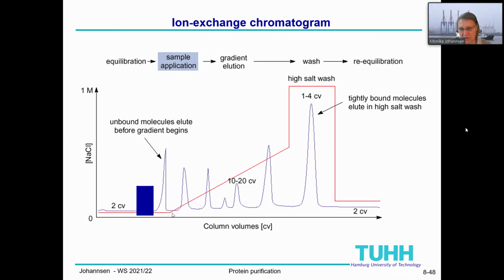Here it starts from a very low concentration, then we have a linear gradient with increasing salt concentration, and then a stepwise gradient to very high salt concentration, and then another step gradient to go to low salt concentration again.